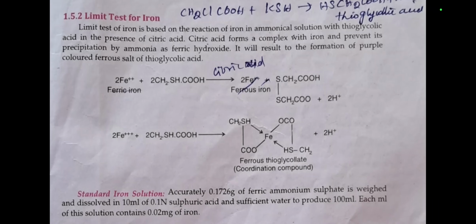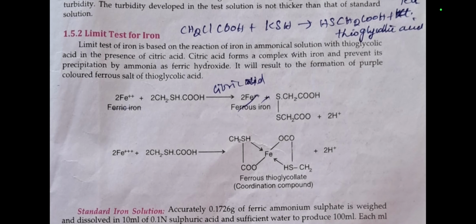My dear student, this session will cover the limit test. What is the principle involved in the limit test for iron, and how do we perform the limit test for iron? How can we compare? Here the colored solution of the test is compared with the standard solution. Let's see one by one.